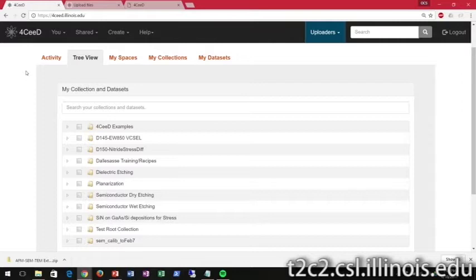And the next aspect that I think is really unique is the ability to preview files that are from proprietary file formats. So I don't have a copy of Digital Micrograph. It costs an incredible amount of money to have one, or I have to use a cracked one. And I think that it's much better to just be able to save those sorts of files that keep all of the instrument metadata complete, and I can still preview the images that I would get from them and treat those previews like they are actual JPEG or TIFF images.